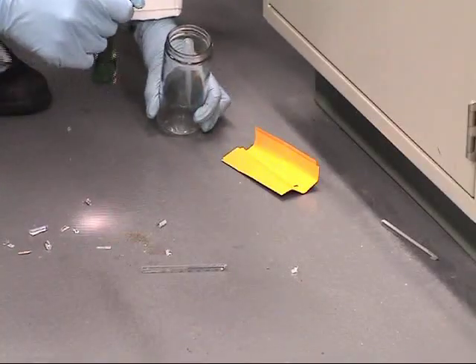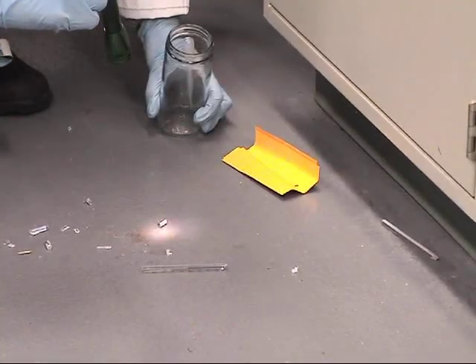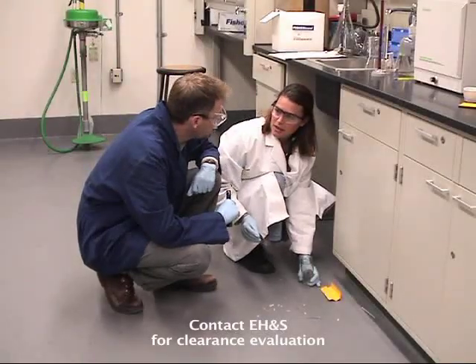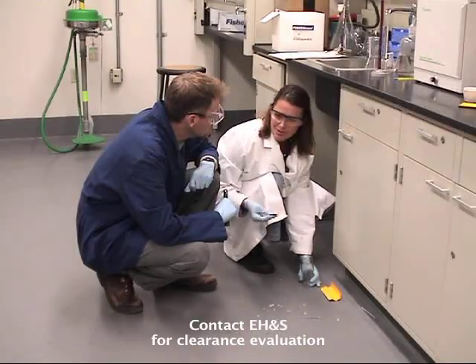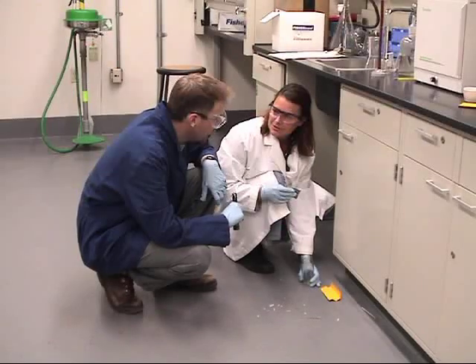If we're not comfortable, we'll call EH&S. You think we did a good job or should we call EH&S? Looks good to me. You know, it does look pretty good, but since I've never done this before, I think I'd feel more comfortable if EH&S came in. So do you want to give them a call and tell them we had a mercury thermometer break and maybe they can bring out some monitoring equipment? Like a Geiger counter or something? I don't think that's it, but something like that. All right, I'll give them a call.